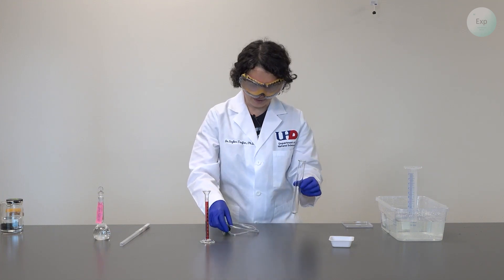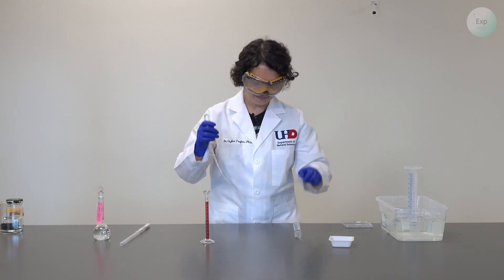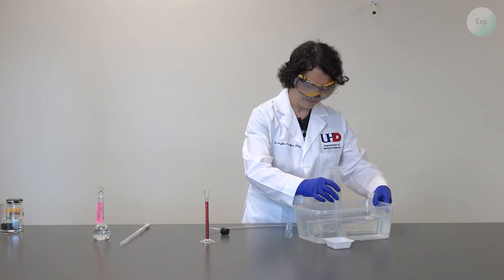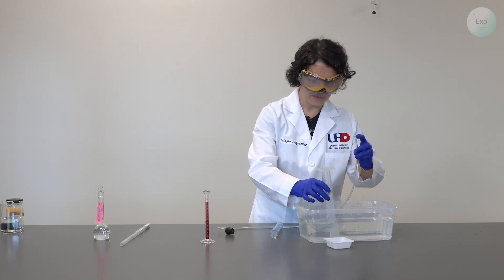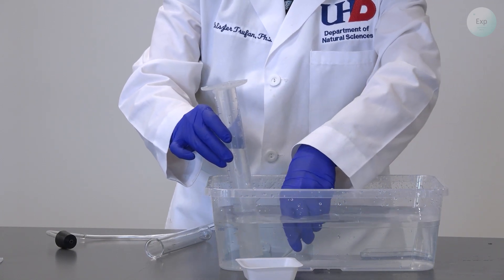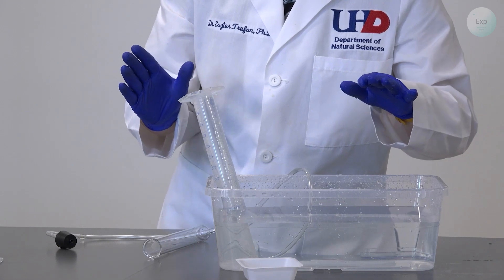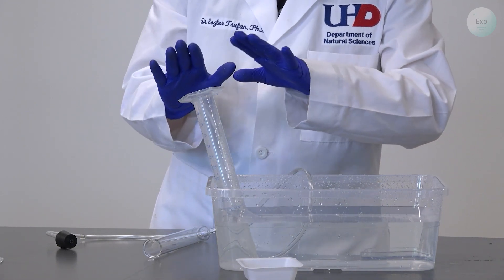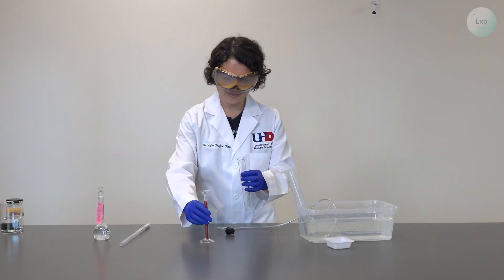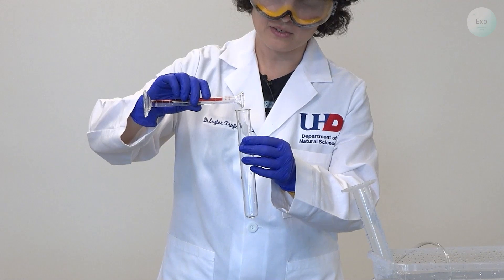Now we assemble the other part of the experiment. First, we're going to take our glass tubing and bring our tub a little closer. We're going to slide the rubber hose right under our graduated cylinder. You can pull up your graduated cylinder just a little bit, but make an effort not to pull it above the water level, because at that point it will release the water you so carefully filled into the graduated cylinder.